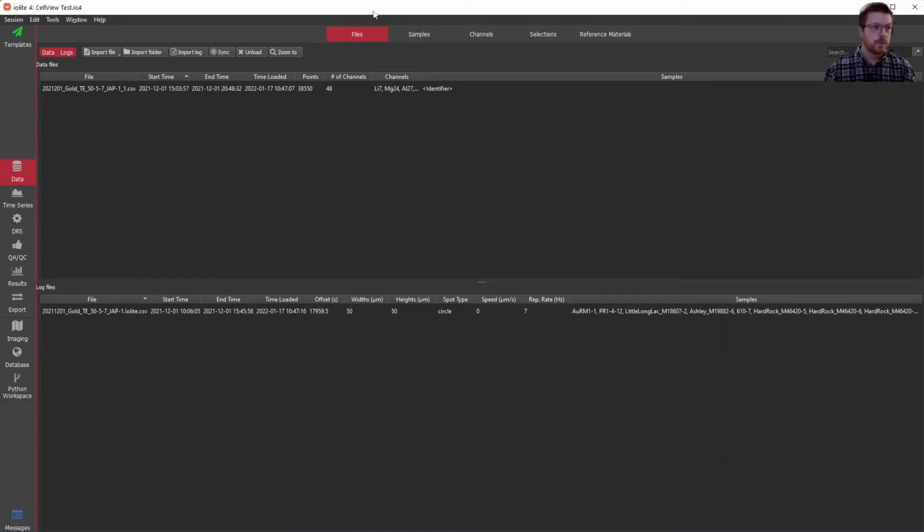For our fourth and final example, we're going to create a sort of reference material data explorer type of tool. So let's just get started. We will go to create a new user interface plugin. We'll call it RM Explorer. A new way to view RM data.